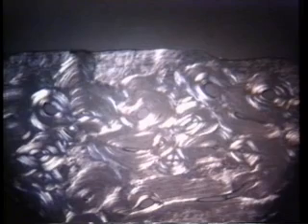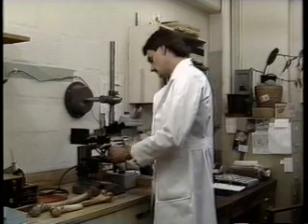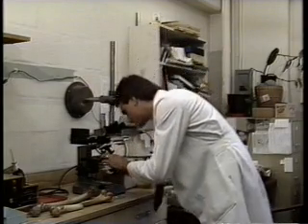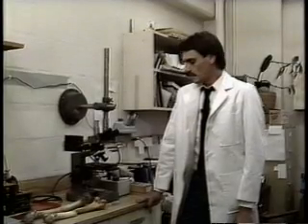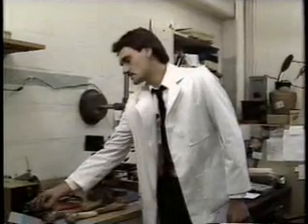If we remove this slide and stick a yet older individual in, this individual is in his mid-60s, and now you can see with ease that this individual is an older age individual because all you see in this field are osteons or osteon fragments. So this is a simple demonstration of how the bone histology changes with age. It is not easy to talk about osteo counting without considering the problems involved with this technique.